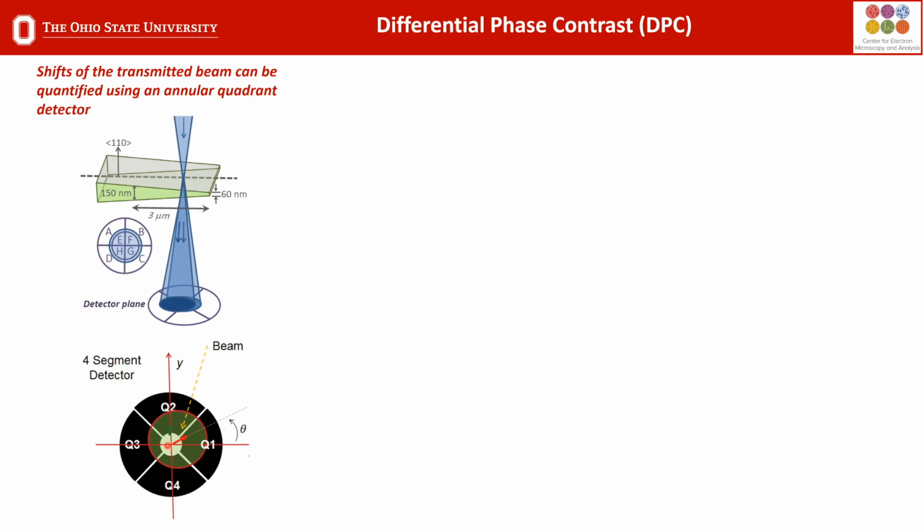And so when we talked about the beam interacting with the sample and the concept of coherently elastically scattered electrons, this is where it becomes important. So Gauss's law would tell us when a converged electron probe passes through the sample, it's going to pass through an electric field. Each of the atoms has a potential, an electric field associated with it. And so when the converged electron probe passes through the sample, the electric field generated by the sample's potential will partially or wholly deflect that beam. And that's the momentum transfer I was referring to within the disk.